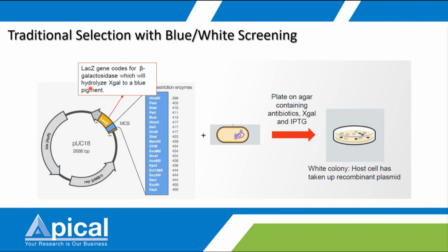It will hydrolyze X-gal into a blue pigment. This means your plate needs to have the antibiotic, X-gal and IPTG.